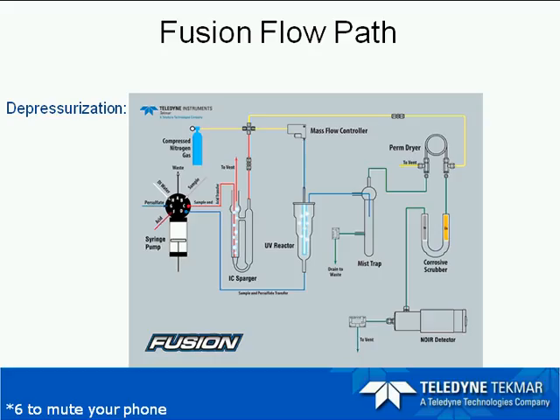In between sample replicates, it will rinse the UV reactor to ensure less carryover, but also between each sample, the needle will remove itself from the sample vial, go over to the sample rinse station, rinse itself, and then proceed to the next sample to ensure minimal carryover.